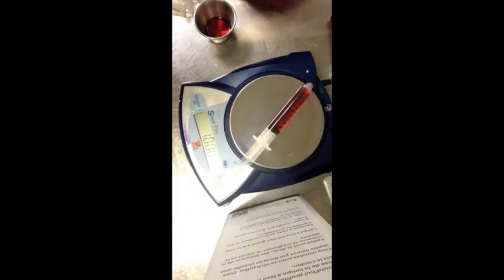So that little drip that I just let off the scale is probably the 0.05 in there.